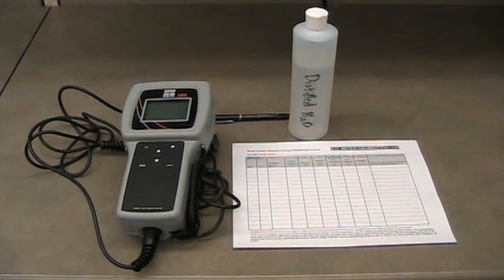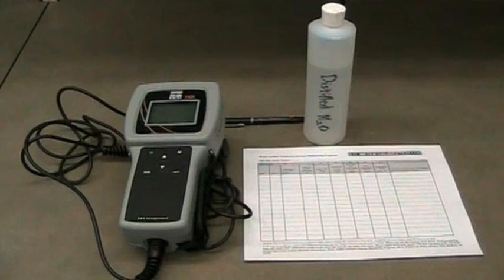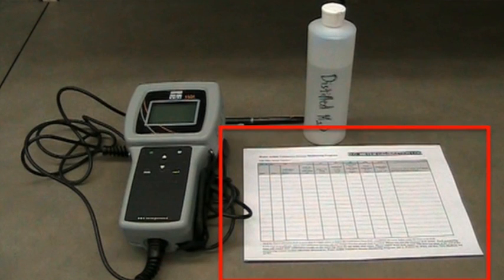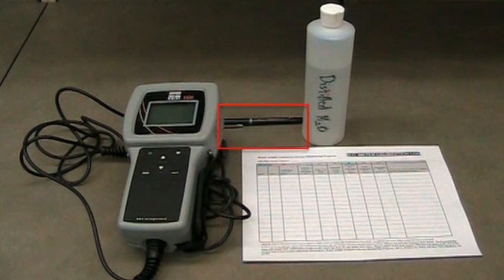To calibrate the dissolved oxygen meter, you will need YSI 550A Dissolved Oxygen Meter, Dissolved Oxygen Calibration Log, pen or pencil, and distilled water in case the sponge in the probe chamber needs to be moistened.